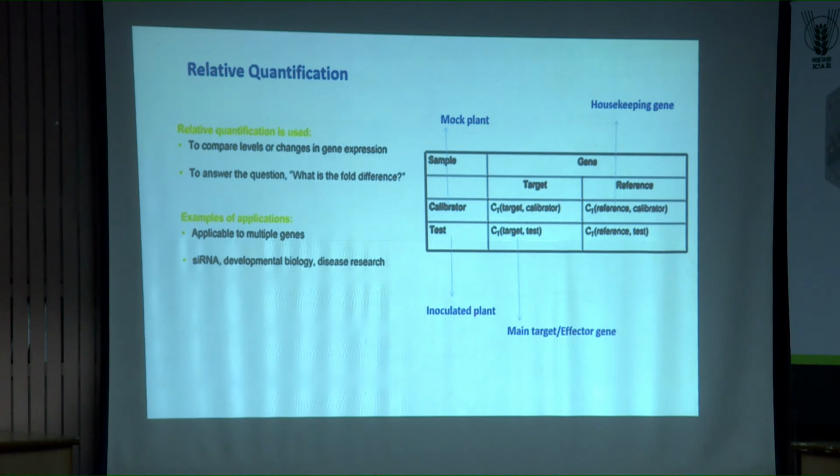So you can study the expression of the plant genes or the pathogen genes, and this is a housekeeping gene, which is normally used in this kind of experiment. What I'm trying to tell you is that these 4 are the minimum in relative quantitation of any target using qPCR. You need to accommodate all of them in your experiments, right?